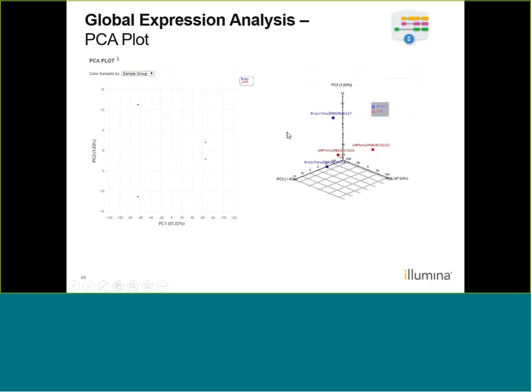So over on the left here, I have our 2D PCA plot, which just shows our 2 principal components. And our principal component 1 here, this accounts for where the most variance was found. And our principal component 2 accounts for the second most variance. So when we're looking at this plot, we see that 2 samples are close together here.